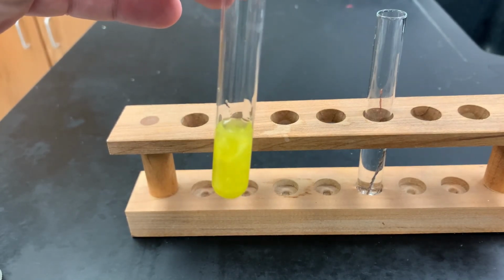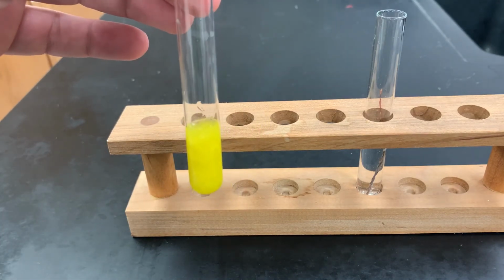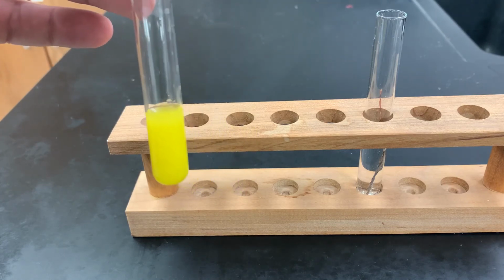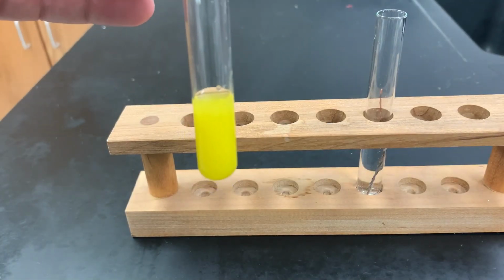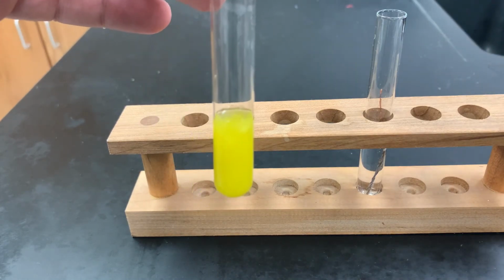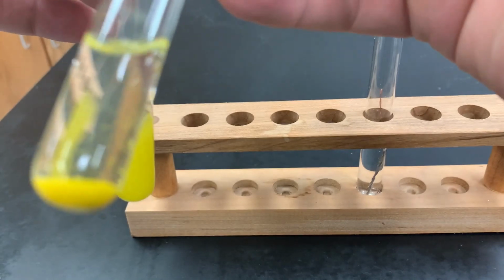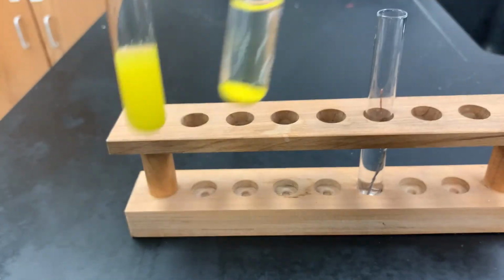Now add that, and you'll see that this yellow substance forms. And that yellow substance is lead II iodide. And that is a solid that will slowly sink to the bottom of the container. And if we take a look at another example that I've already done and let sit for a couple of hours, you can see that the solid lead II iodide has sunk to the bottom of the container. That is our precipitate that we have formed right there.